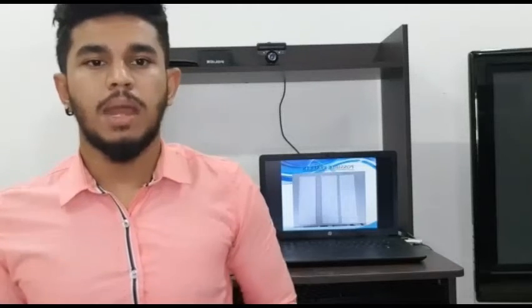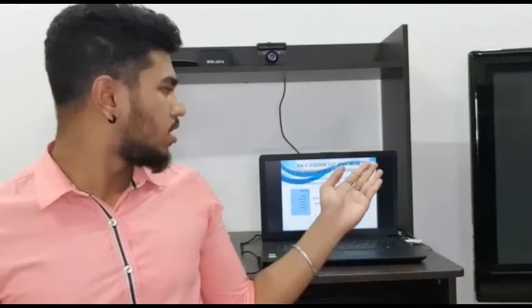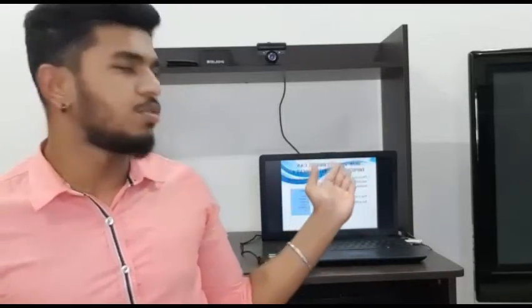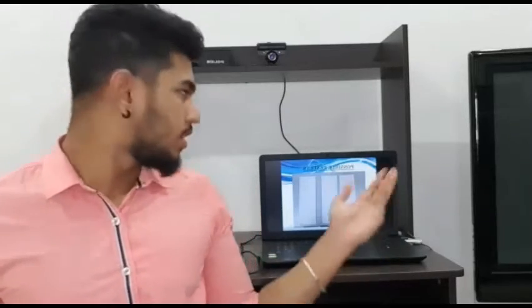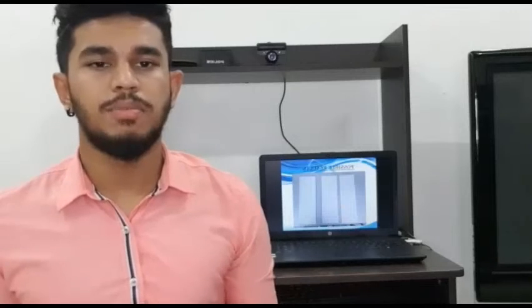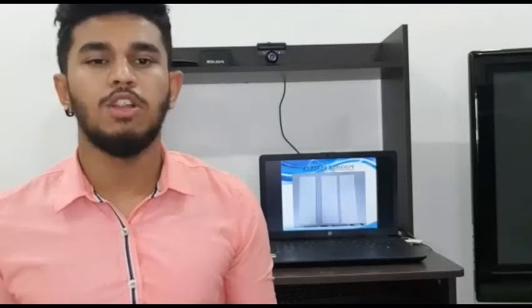So basically, in my part of this presentation, I'll be talking about the possible results and how thin layer chromatography can be used to improve the environment. Okay, so for this slide, the possible results. These results were obtained when we did this experiment in Polytechnic.